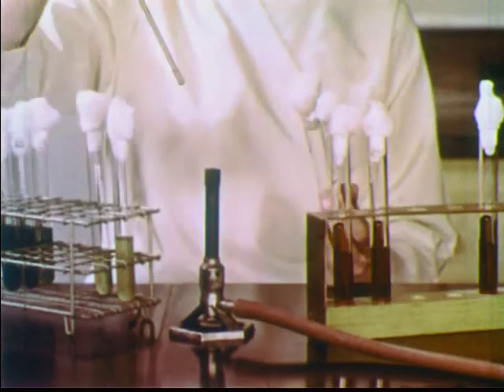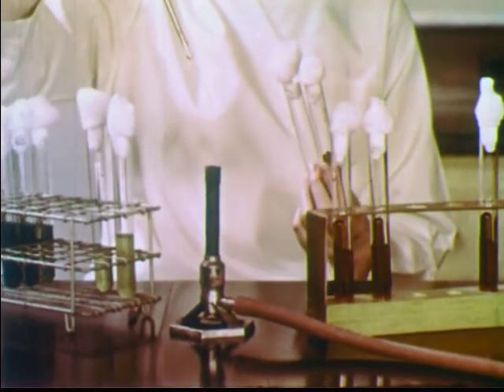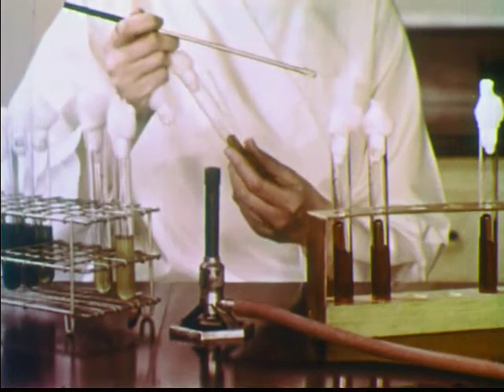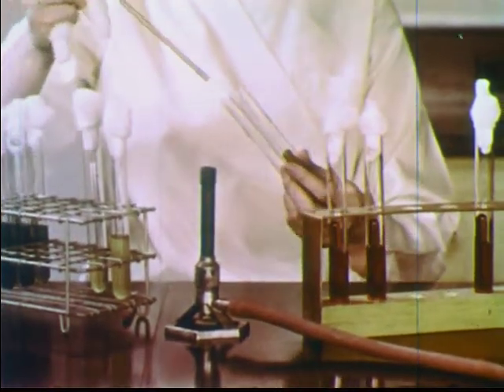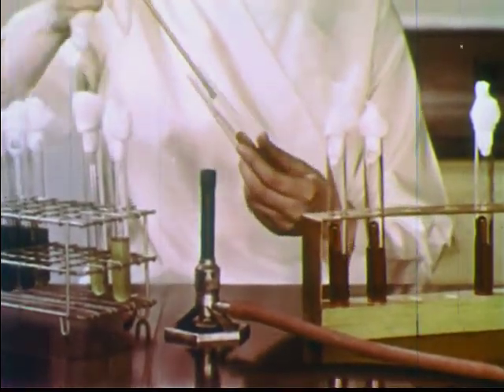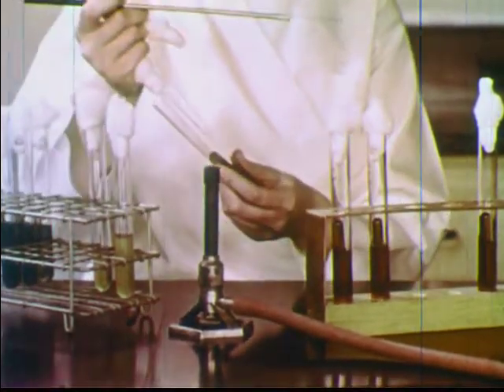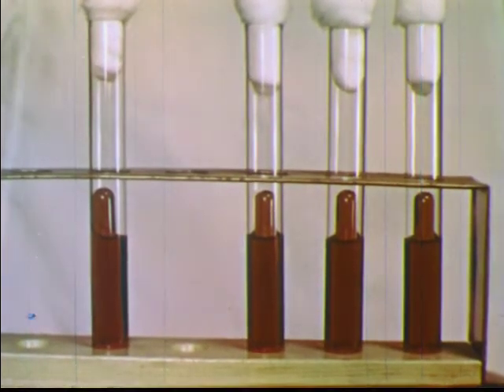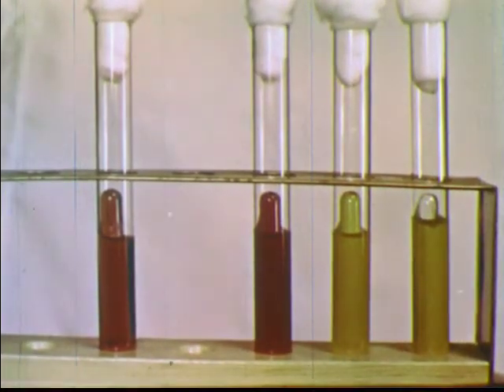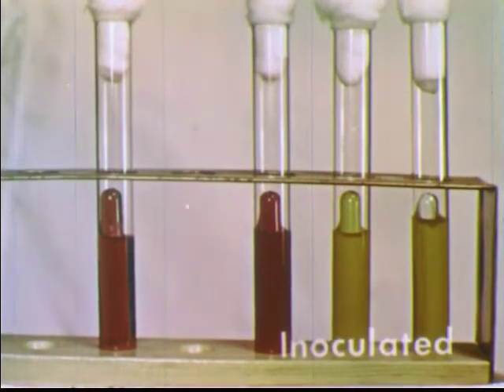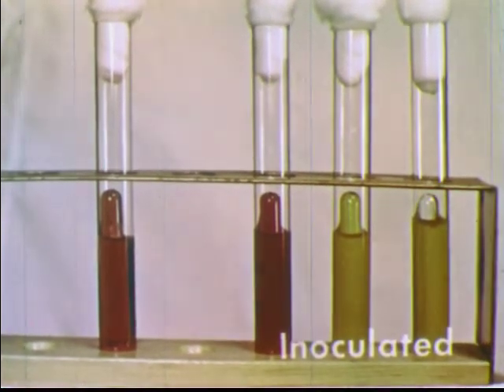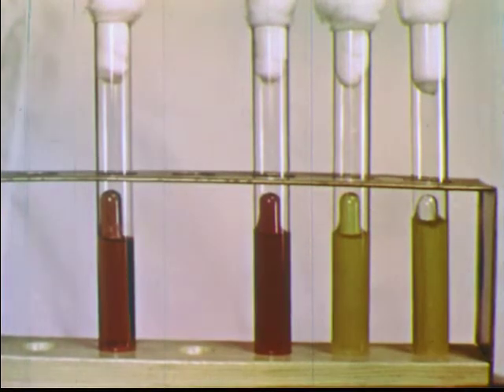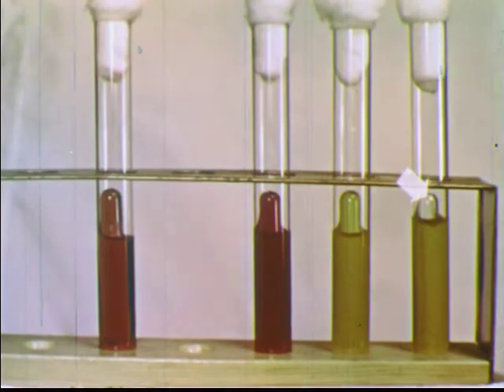In addition to cell and colony features, the metabolism of bacteria is also important in identification. For example, pure cultures of various bacteria can be transferred, or inoculated, into nutrient solutions containing a sugar and an acid-base color indicator. After incubation, the breakdown of the sugar by various bacteria is indicated by color changes, as compared to the control tube which was not inoculated. Some bacteria also produce gas, which collects in the small inverted tube.